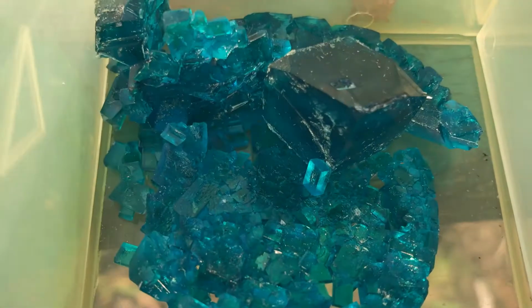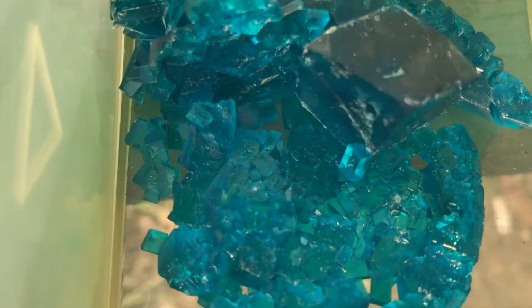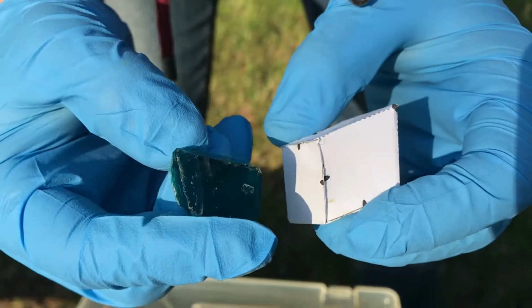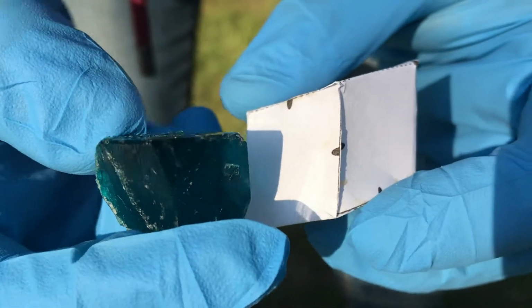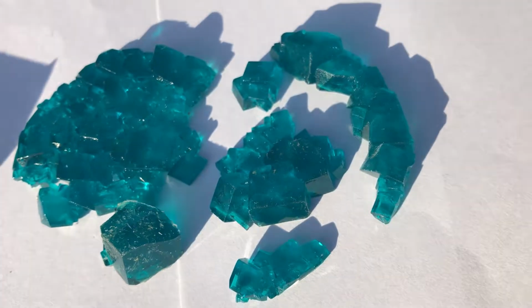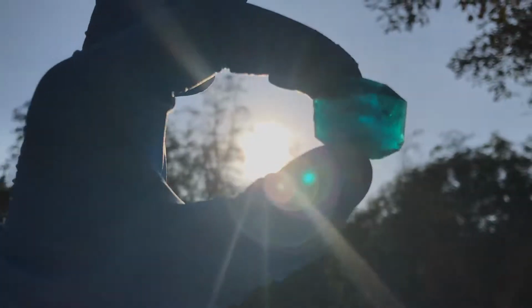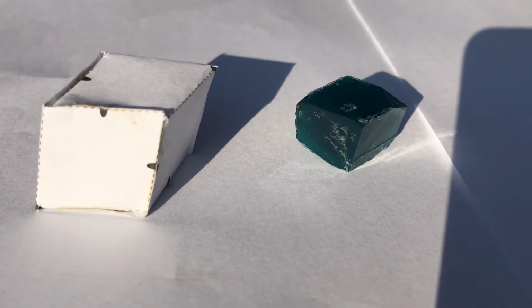These ones are crystals made from nickel and potassium double sulfate. Now, the lab gloves are essential because the nickel salts are very toxic, even covered with nail polish. I have grown 2 single crystals and some polycrystals, and I think they could easily be a part of a table decor. Because of the temperature fluctuations, one of my single crystals has dissolved and then was exposed to air.